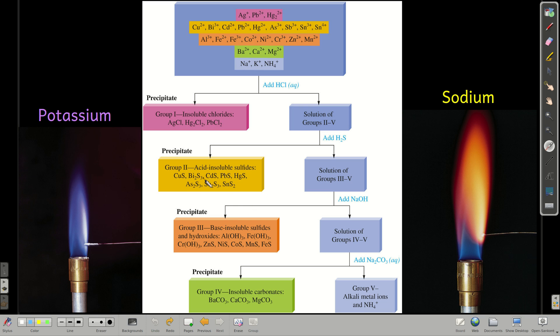So again, we get a solid, centrifuge it, decant off the liquid, and what we have left is group 3, 4, and 5.